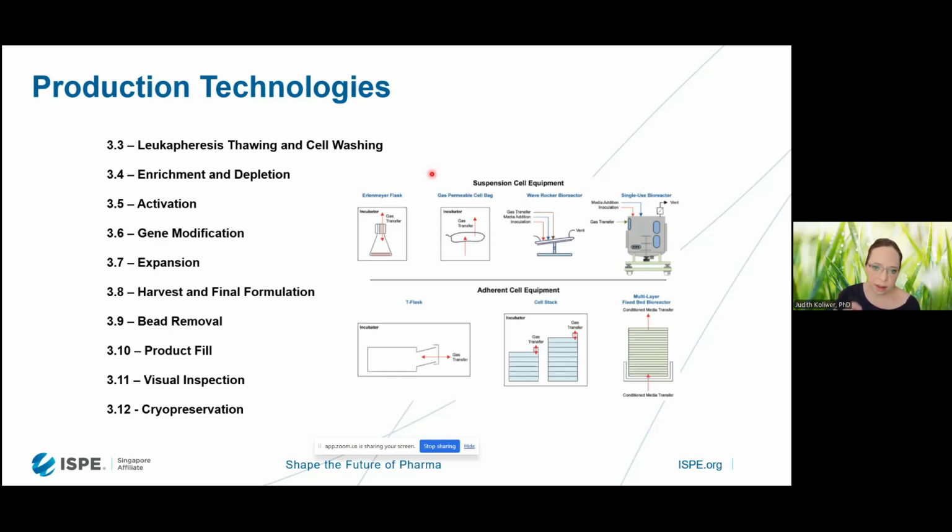A second parameter that we have discussed a lot is how well our equipment can separate between living cells and dead cells, because what we really want is, of course, our living cells separated from the old media, our freezing media, and any dead cells. So really the precision with which the separation between living and dead cells happens, depending on the g-force, is something that we have seen as a consideration.